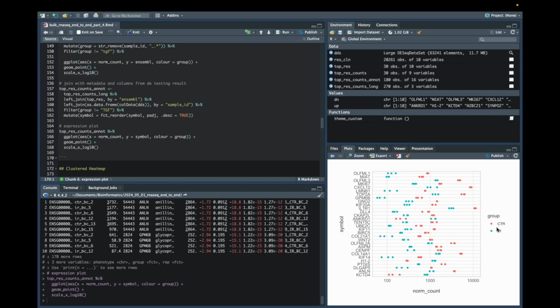So just as with the volcano plots that we created earlier, spending a bit of time refining the plot aesthetics, such as adjusting the colours, axis labels or titles, can transform the preliminary version into a more polished publication ready figure.